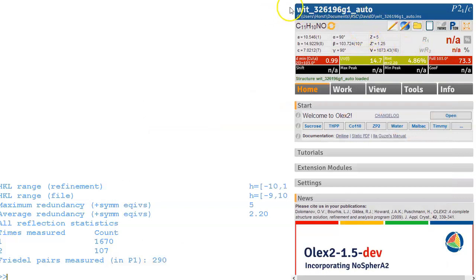Now if I look at the file, it's called WIT. So that stands for what is this in the RIGACO world. So probably this was a two-minute data collection. So let's see what we get out of a two-minute data collection. So the first thing we need to do, we need to find our way around Olex2.